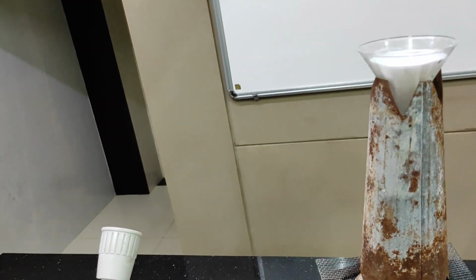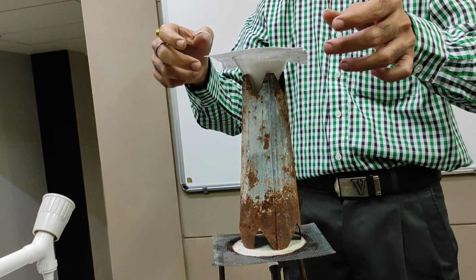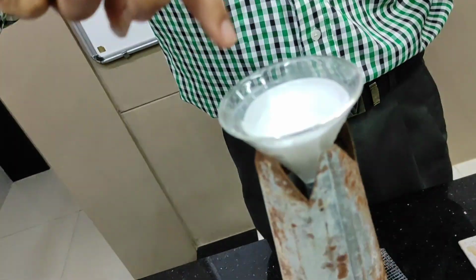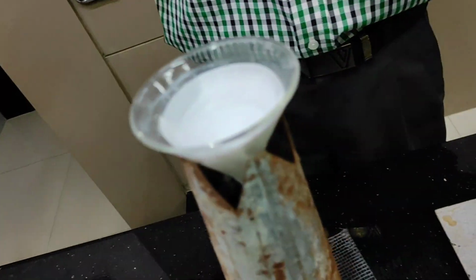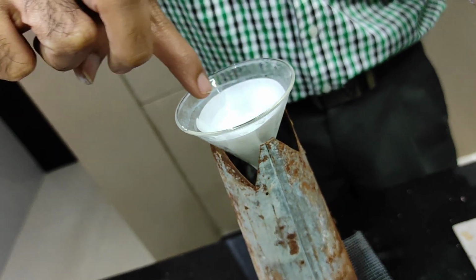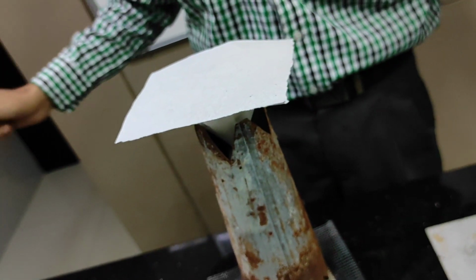We'll try to cover it also with a filter paper so as to make sure that no impurity goes inside it, like this, and see how to check whether the drying is done. Right now, my dear friends, the filter paper is wet and therefore it sticks to the sides of the funnel. So the drying has to be carried out till we can easily rotate this entire filter paper. Once we are in a position to do the entire rotation, it is a clear indication that the drying process is completed. Alright, so we'll just keep it as it is for some time.